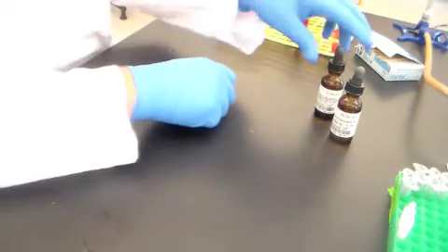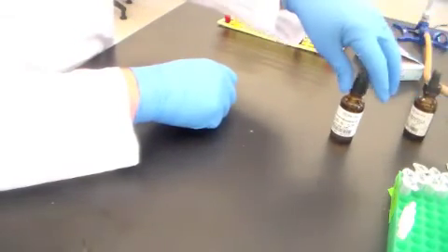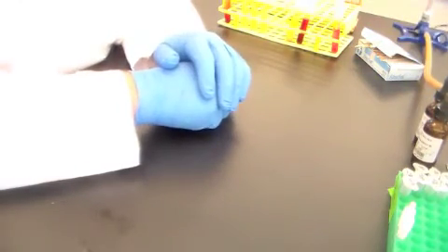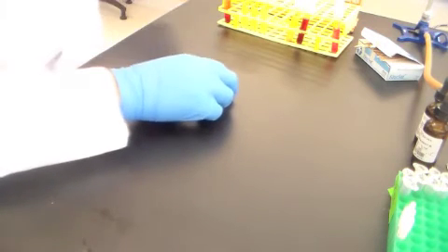So hopefully what you'll find as you do your nitrate tests is a collection of bacteria that are truly nitrate positive, nitrate reductase positive, some that are nitrate negative, and some that have reduced nitrate to some form beyond nitrite. So please read the PDF posted on the Blackboard site about the nitrate test. Hopefully it will make it less confusing than I feel like I just made it.